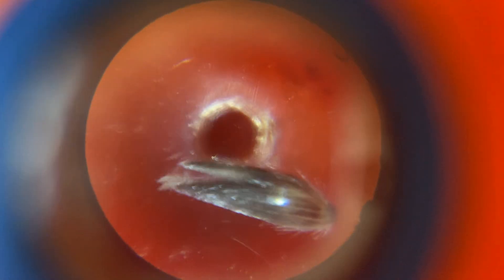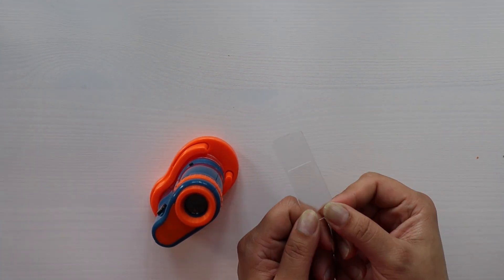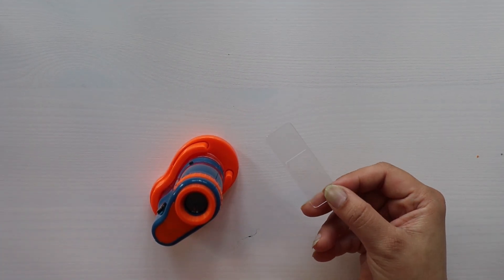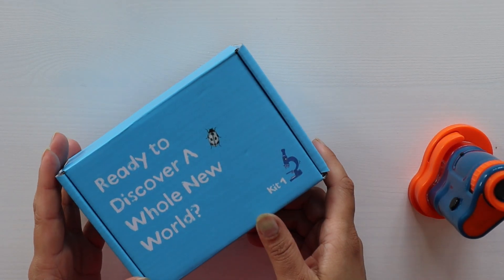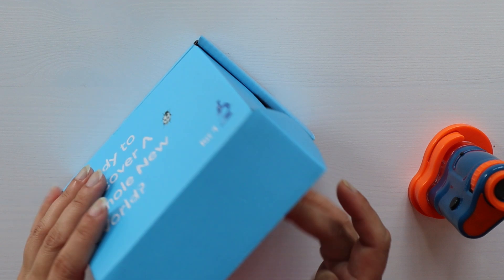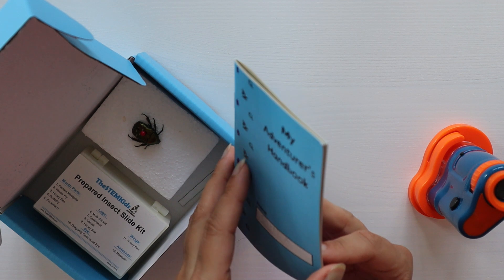You can keep any sample on this slide in this opening — just press this button. Kids can use different things like play-doh, rocks, or anything they find.